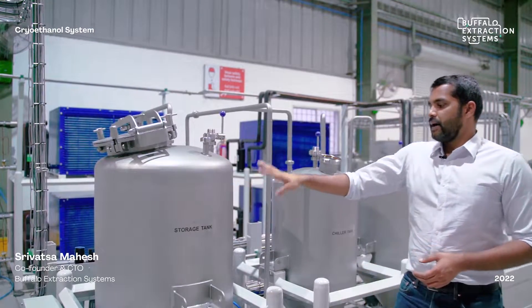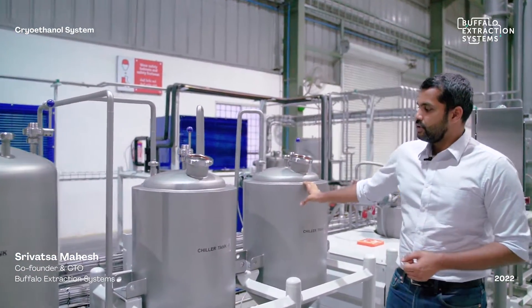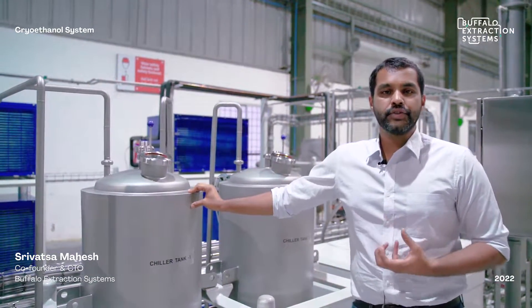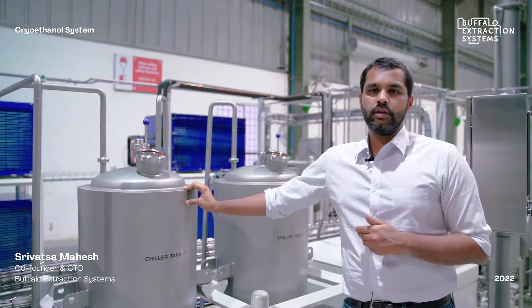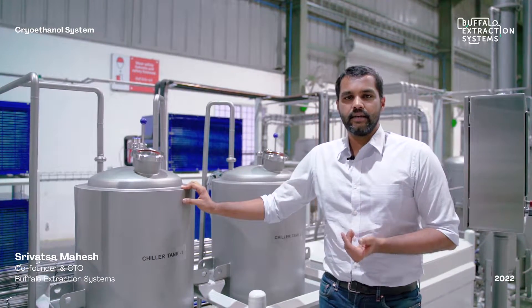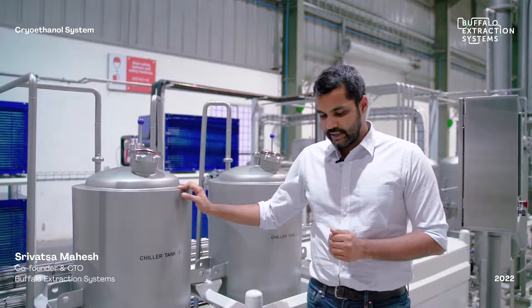The first step after the storage is the pre-chilling skid, where the ethanol is chilled down to minus 40 degrees Celsius. This is done by recirculating the ethanol through a heat exchanger connected to a condensing unit, which reduces the temperature of the ethanol to minus 40 degrees Celsius.